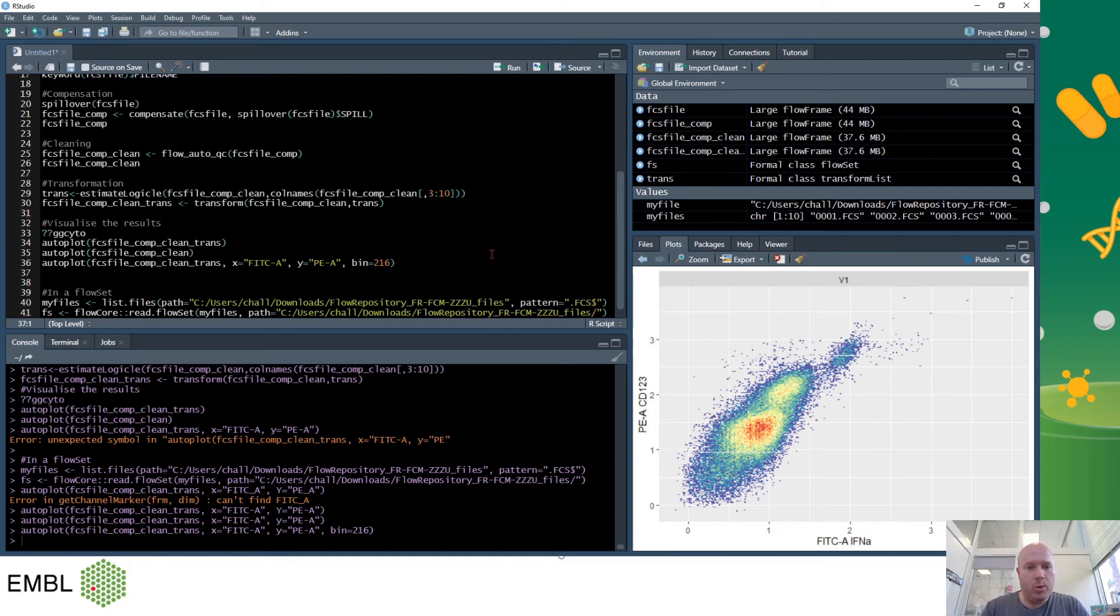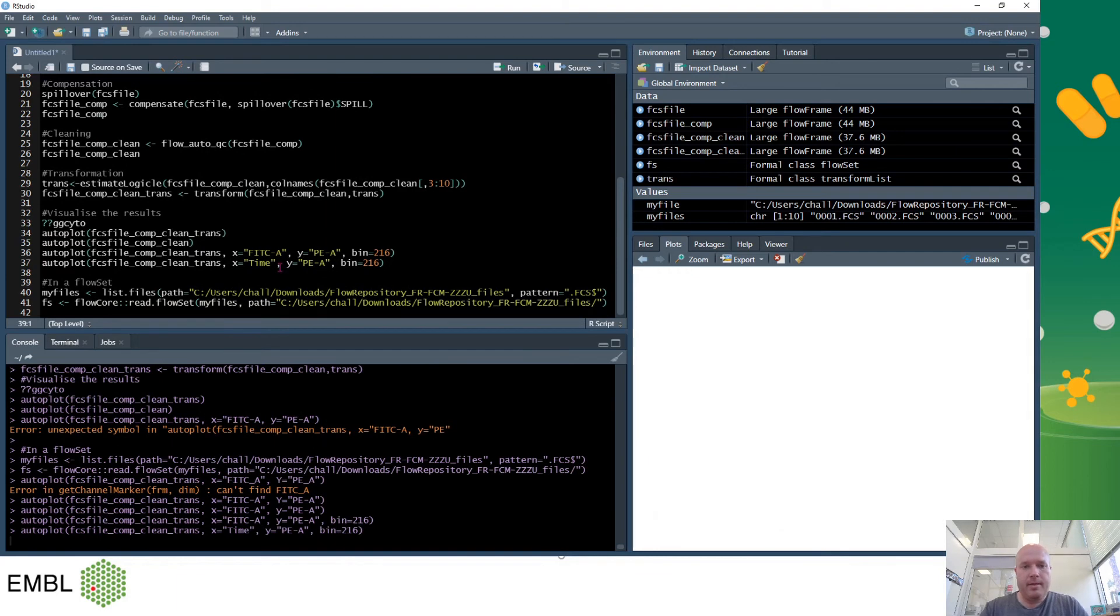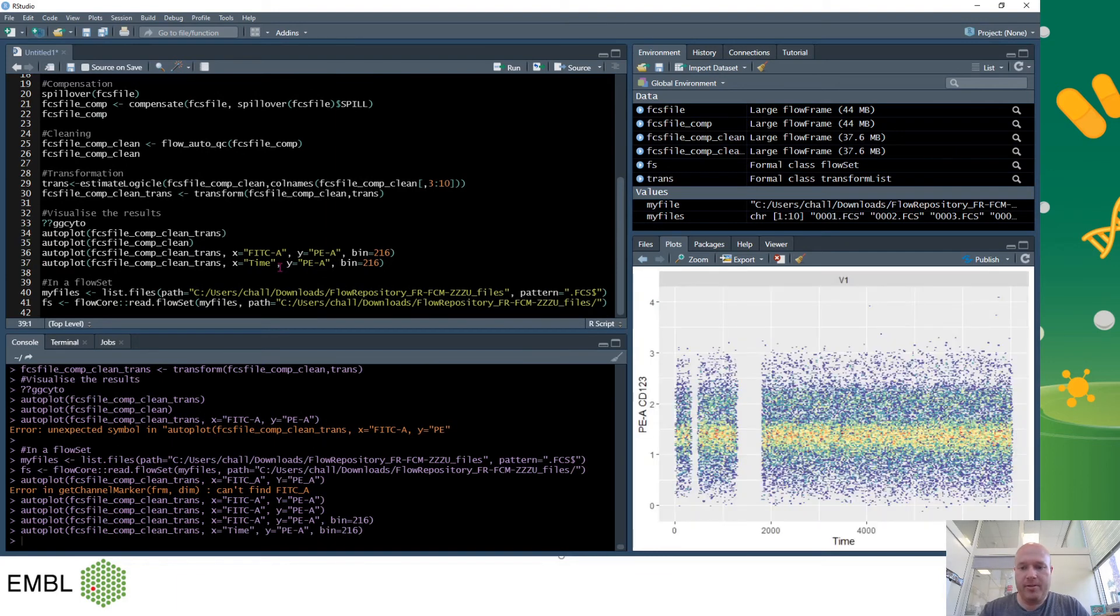And so this is useful so now we can visualize what happened in our cleaning step. So we can use the auto plot again, just highlight it and copy it, and I'll change one of these to time. And then we've got the plot of time and we can see we have some gaps here.